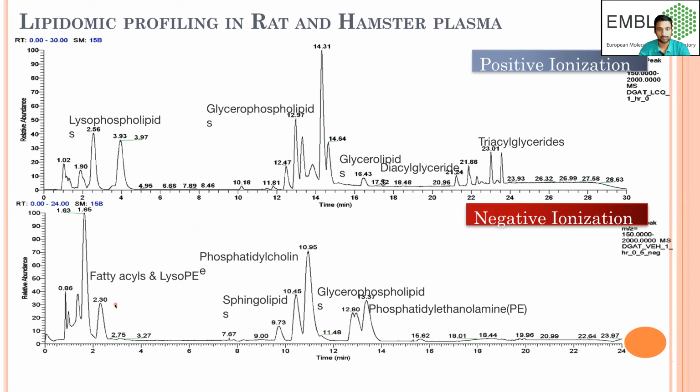For example, this is one of the lipid extracts which we ran from a plasma sample of a rat, and this way we detect the lipids.